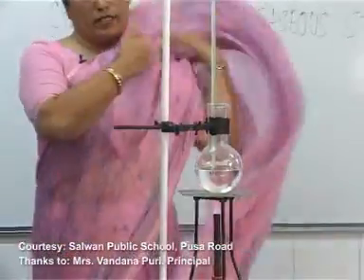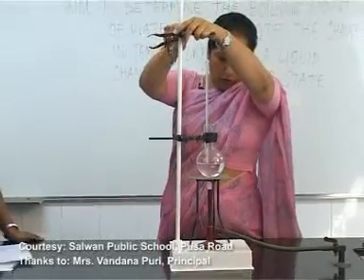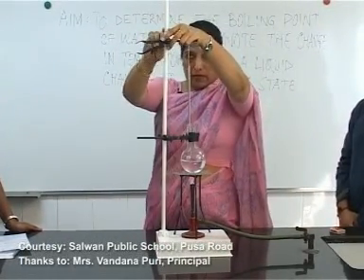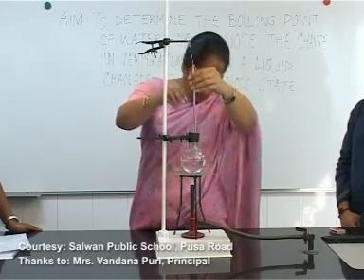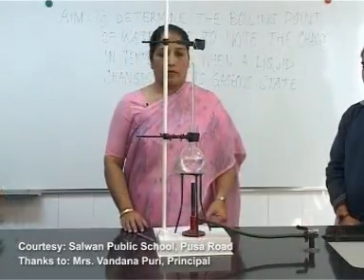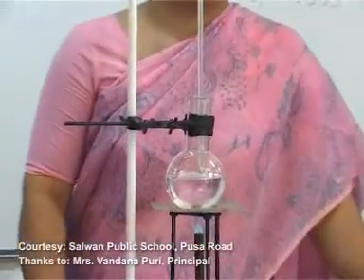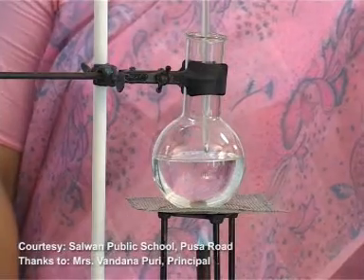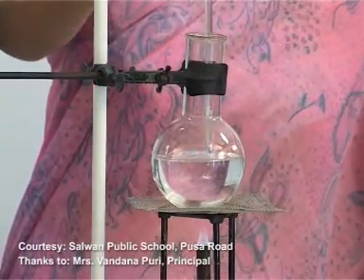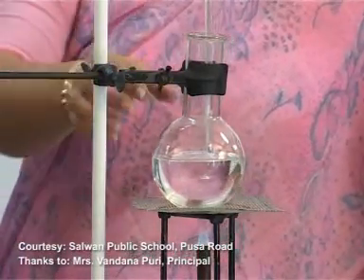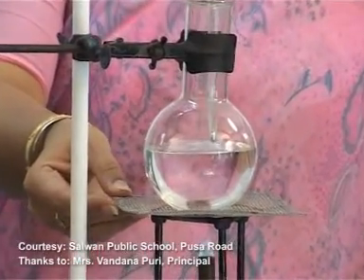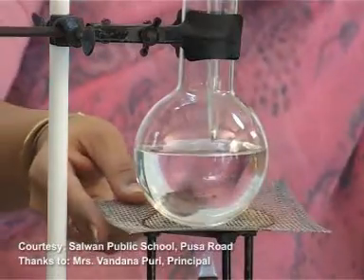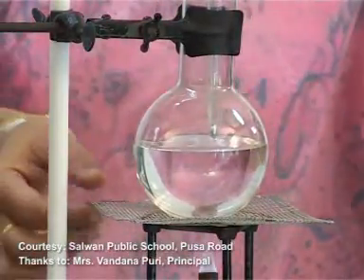Let us see a few precautions for this experiment. Certain precautions are to be followed. One is the thermometer should not touch the walls of the glass flask. Second, we have to use a wire gauge. We should not heat directly on the flame — we have to use a wire gauge.